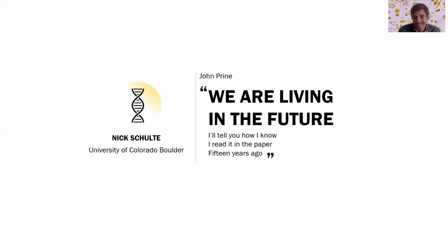I love this question because it speaks to some of the things we don't know yet about how morphology and DNA sequencing differ. I would say definitely that clustering OTUs at 97% is arbitrary, and we do not have a firm handle on, for different amplicons, what that species resolution actually is. Are we getting species level resolution for all taxa? Are we doing it for a subset of taxa that have a higher variability?